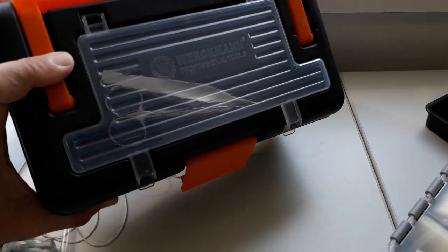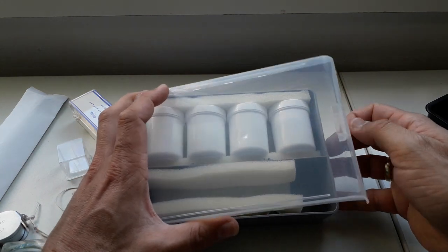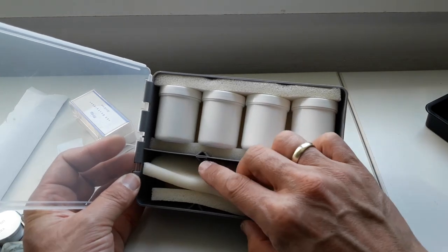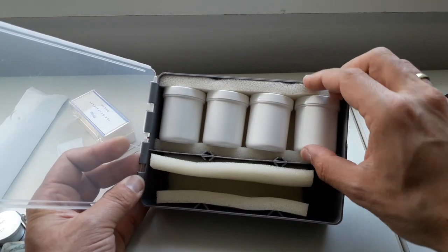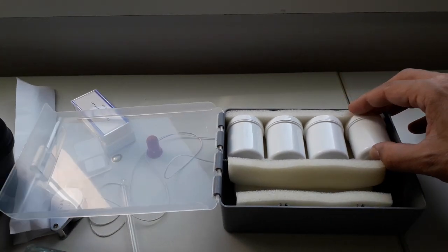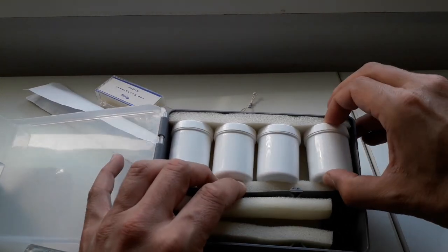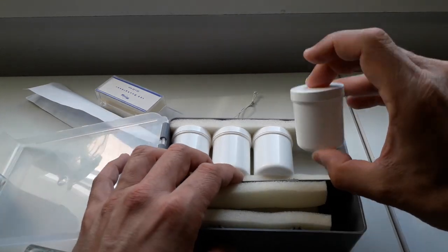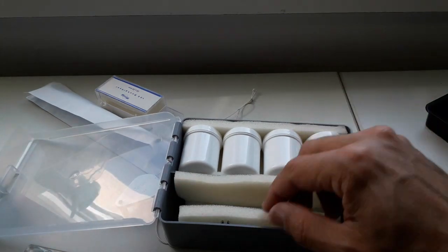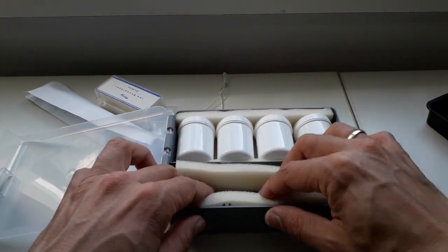Before I had this larger box here, I used another small plastic box. This one is actually also from a hardware store, where they sell these for screws. There you have little plastic separators in here. When I go out sampling and do not want to take along the large box, I take this small container along, and I put some foam material in here so that the containers are held in place. The tools go in here, and I also put some foam material in here so that it doesn't make too much sound.